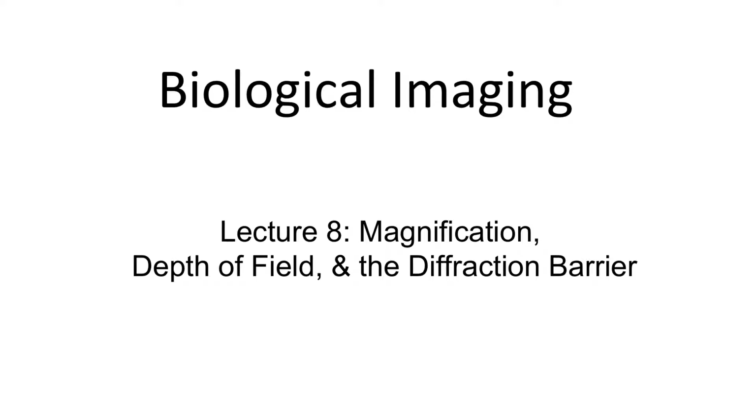I'm Joe DeGeorgis. Today I want to talk to you a little bit about magnification, depth of field, and something known as the diffraction barrier.